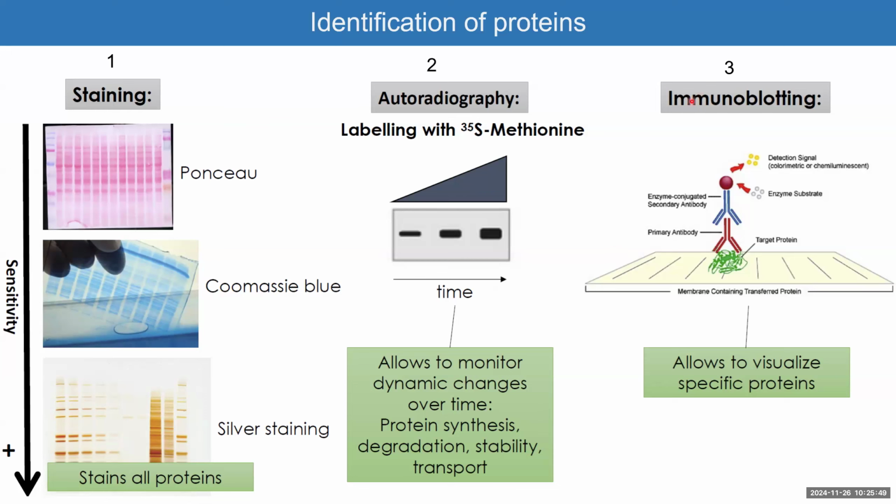And that's what we call immunoblotting, because now, instead of having the proteins embedded in this gel after they run according to their molecular weight, I can have them blotted exactly the same way they look here, but now they are on the membrane. Then I may want to look at one specific protein, let's say actin or myosin or a surface protein, whatever that protein is.